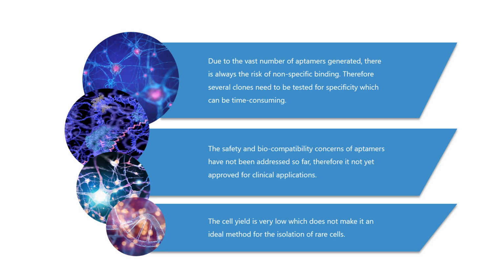There are some potential limitations as well. 1. Due to the vast number of aptamers generated, there is always the risk of nonspecific binding. Therefore, several clones need to be tested for specificity, which can be time-consuming. 2. The cell yield is very low, which does not make it an ideal method for the isolation of rare cells. 3. The safety and biocompatibility concerns of aptamers have not been addressed so far, therefore it is not yet approved for clinical applications.